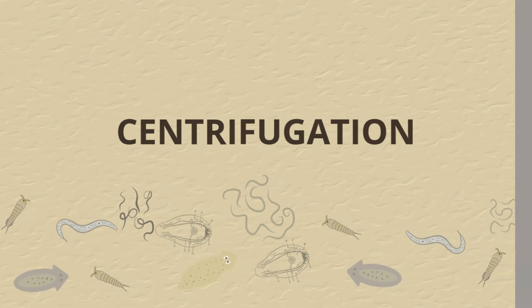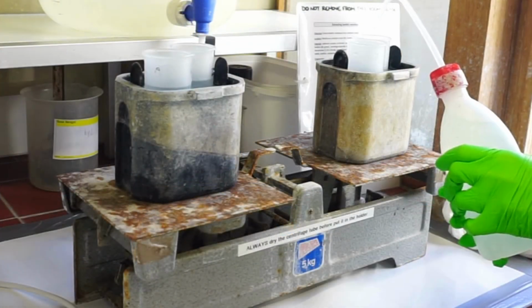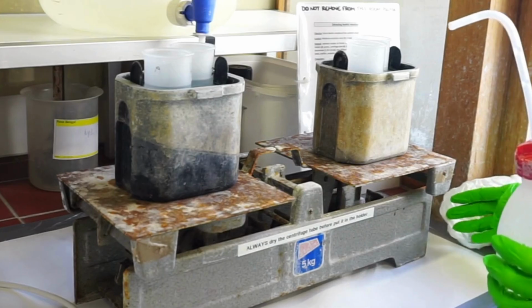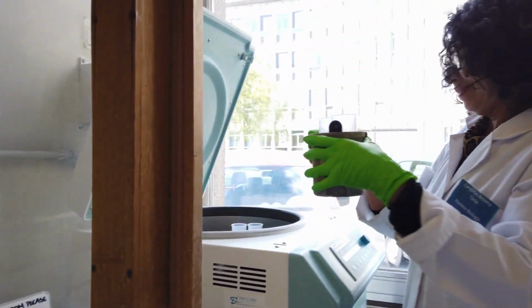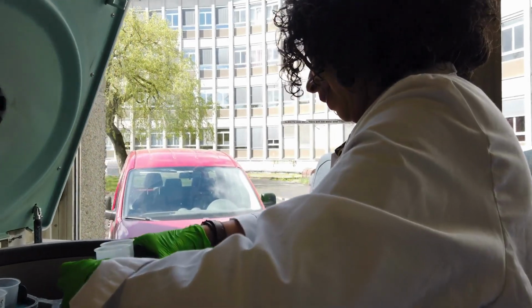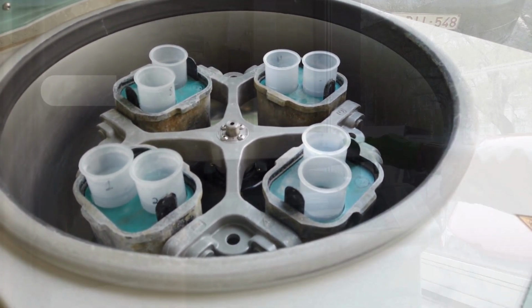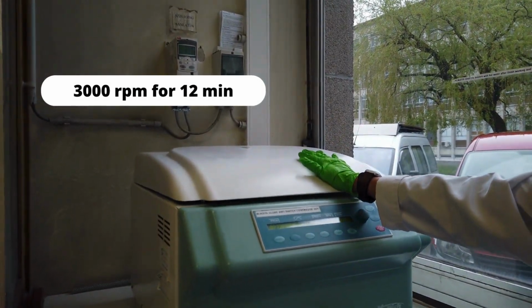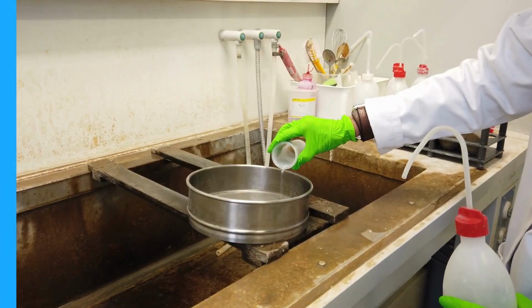Centrifugation. All tubes and tube holders are balanced before placing them in the centrifuge. The opposite sides of the centrifuge must have the same weight. The centrifuge program is set at 3,000 revolutions per minute for 12 minutes.